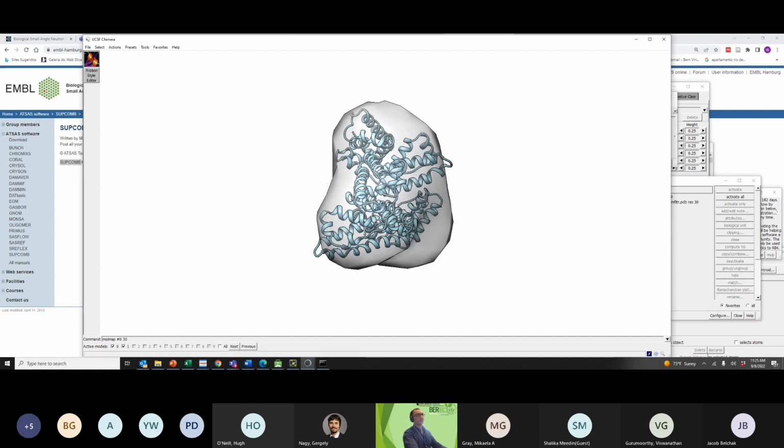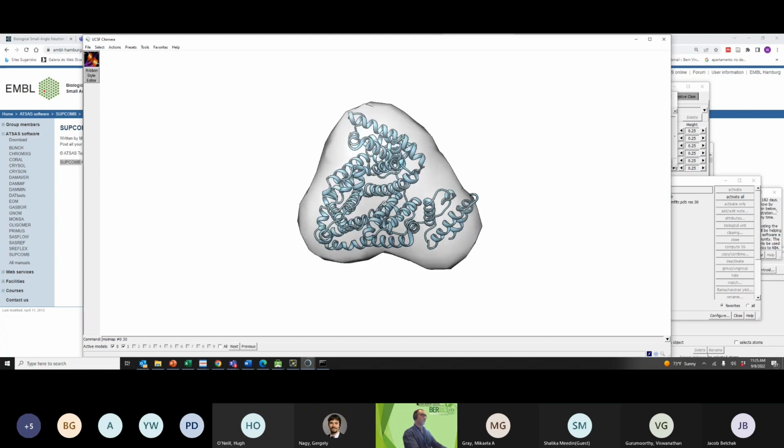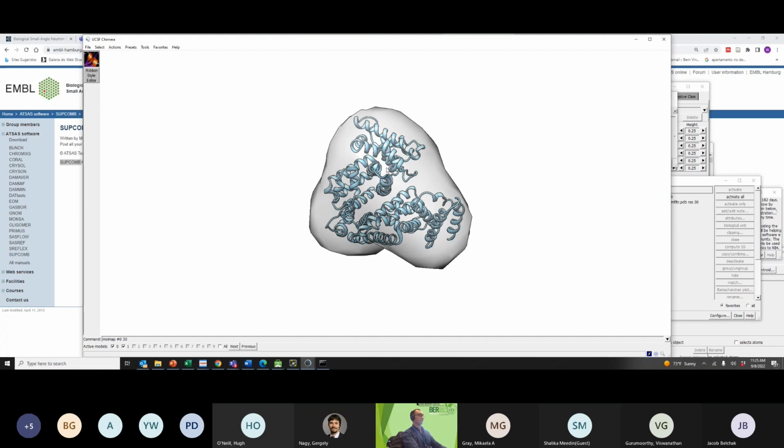It is a very nice representation of the overall conformation of our data. So you already have a figure ready for publication here, and you definitely can use it. In Chimera, you can definitely do more things to visualize, such as different colors for the second structure, but that's not my aim here now.